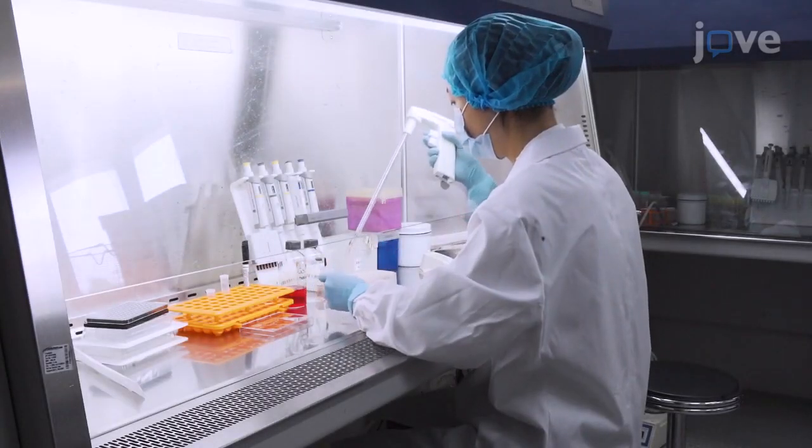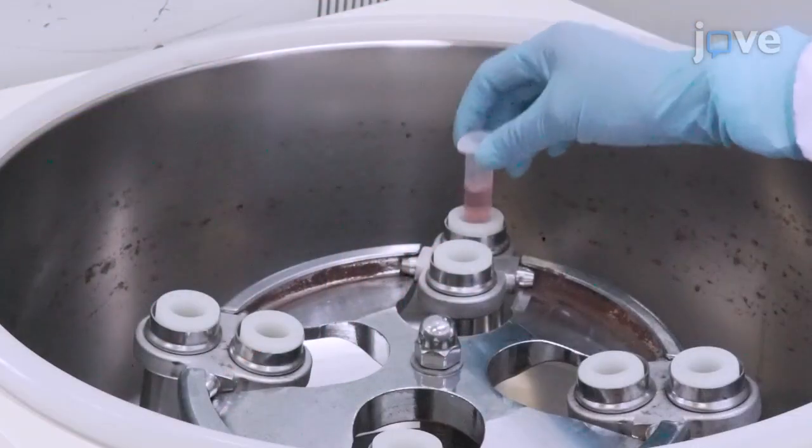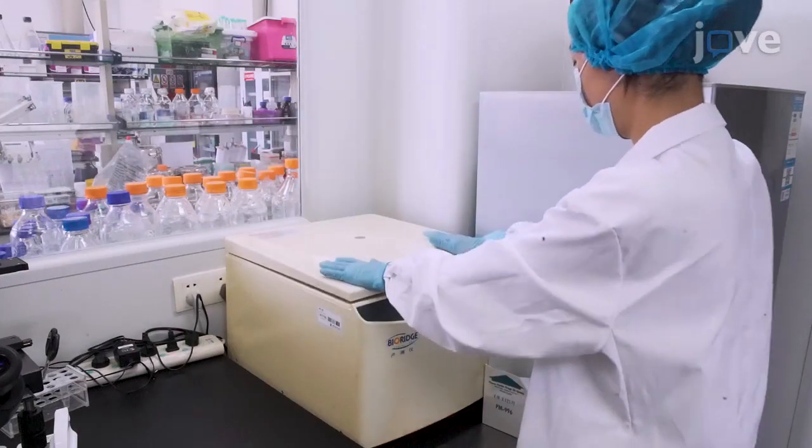Begin by collecting the glioma stem cells or GSCs from the culture medium and centrifuging them at 70 times G for 3 minutes at room temperature.